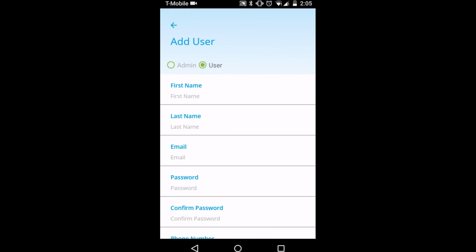They can create, edit, delete locations. They can add, edit, delete TraceableLIVE devices. They can create, edit, delete users. They can edit the credit card information and the address on file, pretty much everything.